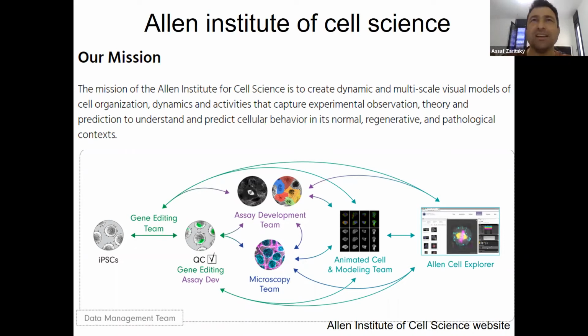And so these are two initiatives that generate a lot of imaging data. They generate computational tools. They drive the field forward. There is also another thing. There is the Janelia Research Campus. Janelia is HHMI, another philanthropic effort. They have the best microscope builders in the world and the best microscopes in the world. You can actually go there to use their microscopes and take images with them.